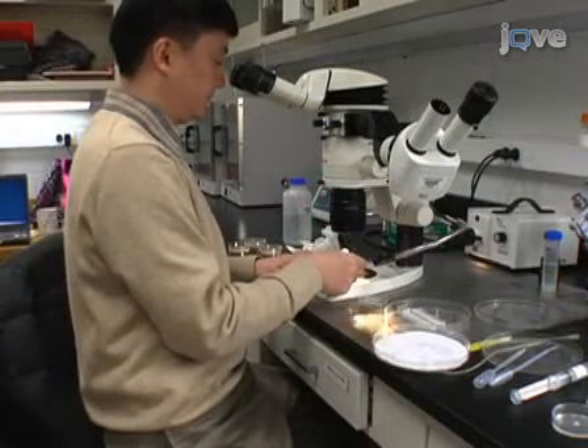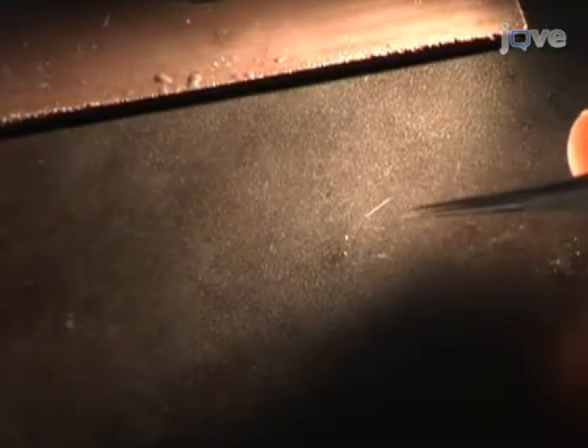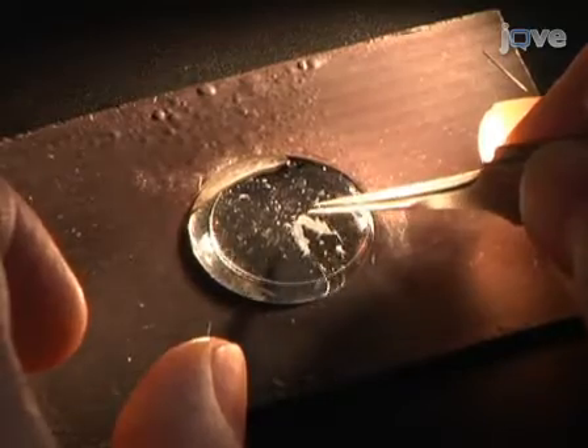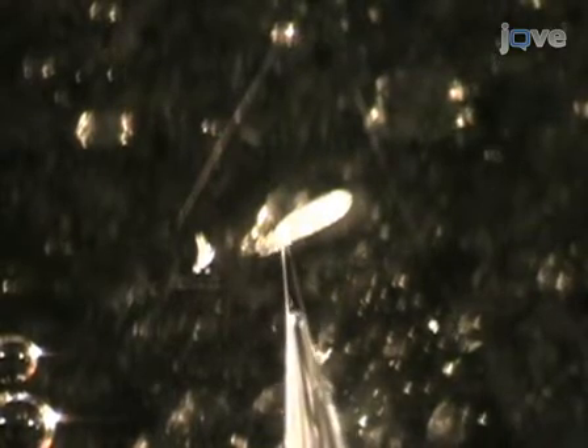Begin the dissection by transferring an embryo of interest to a Silgard-coated coverslip under a drop of saline, with its dorsal side up. Remove the vitelline membrane by making a small incision in the membrane with a glass micropipette or a tungsten needle, then gently free the embryo from the membrane.